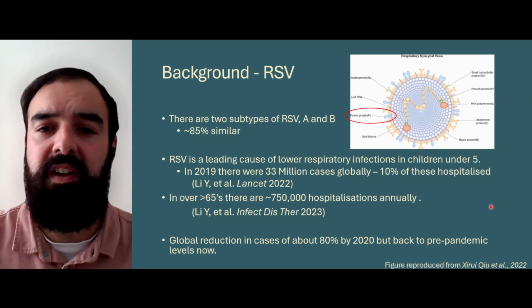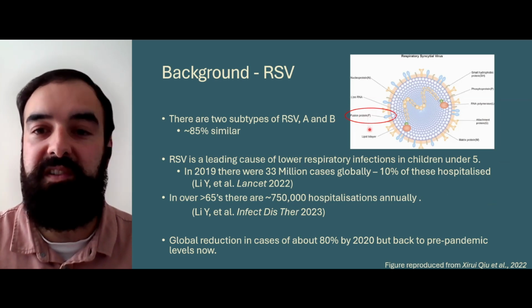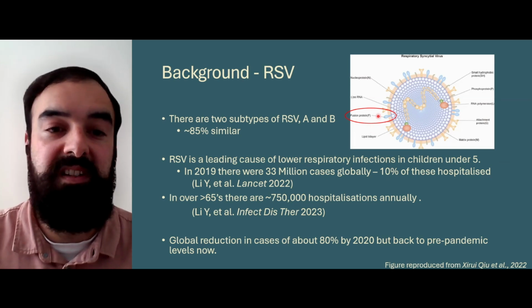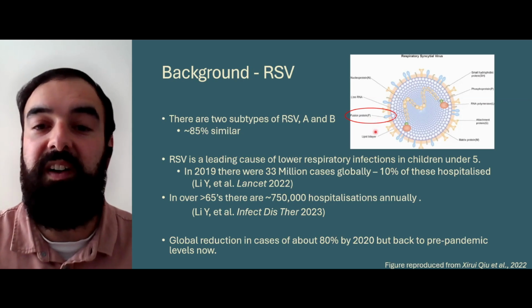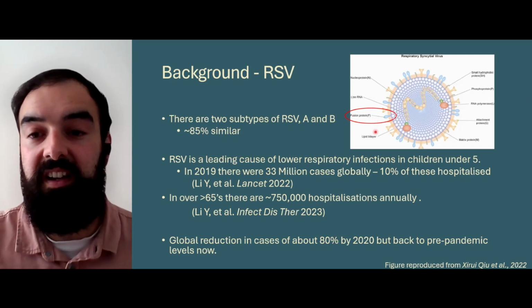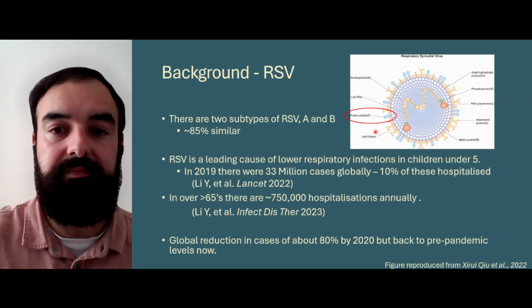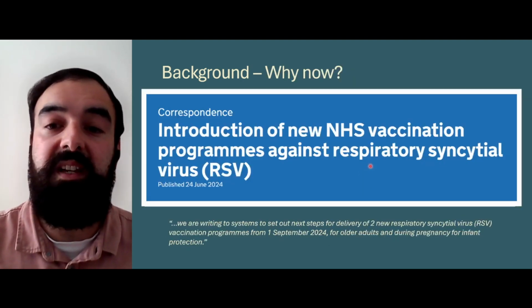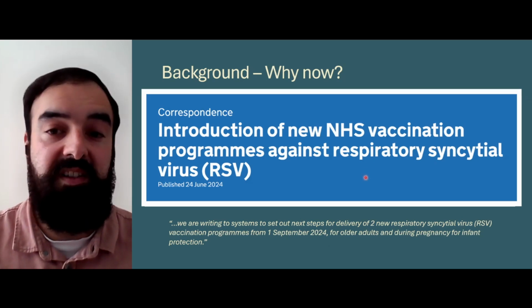So before we move on, I'd just also like to quickly draw your attention to the diagram in the top right of the screen, and in particular to the cell surface protein encoded by the F gene. This is the fusion protein, which is vital for cell adherence and infection, and is a key target for current therapeutic interventions. And speaking of which, recently there has been a renewed interest in sequencing RSV at scale, as a number of countries have initiated vaccination programs.